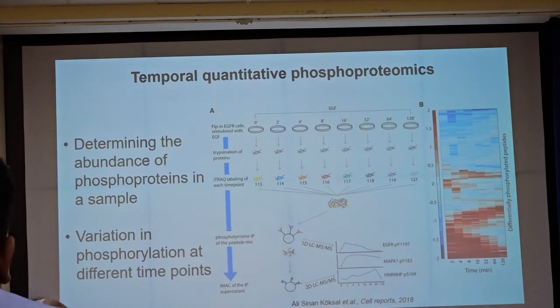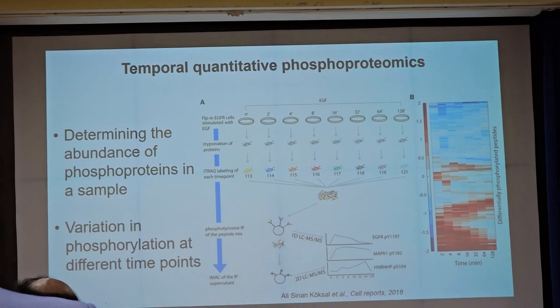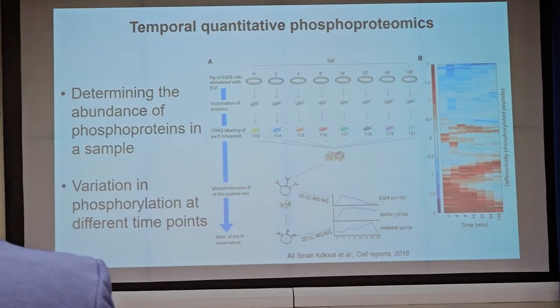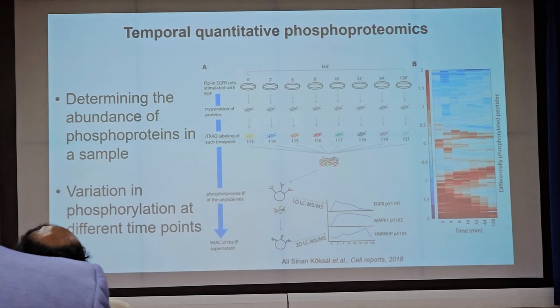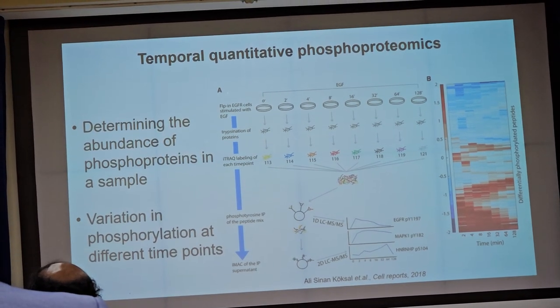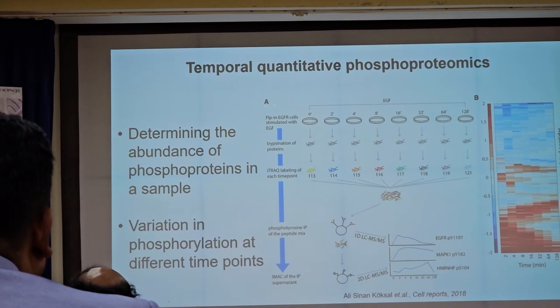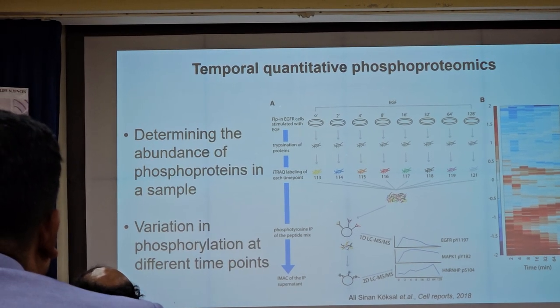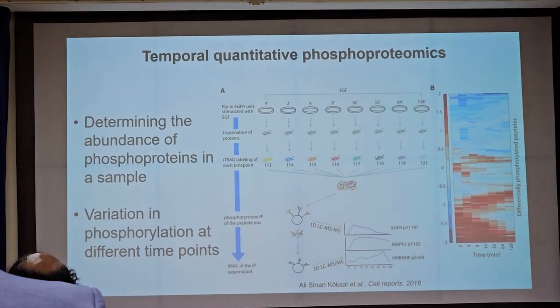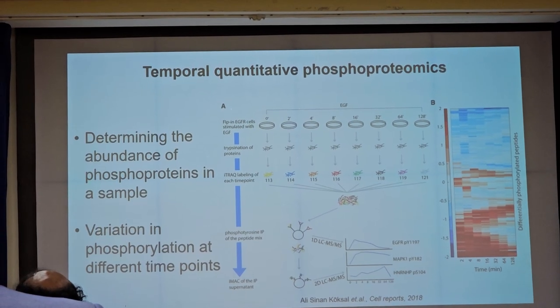This is time-lapse quantitative phosphoproteomics, with which you can derive, if you develop proper animal models and cell line models, what is happening instantly when a drug is given, or when a disease model is modified to a recovery model. Whatever phosphorylation changes happen in the disease model, are they all recovered by the drug in the recovery model?